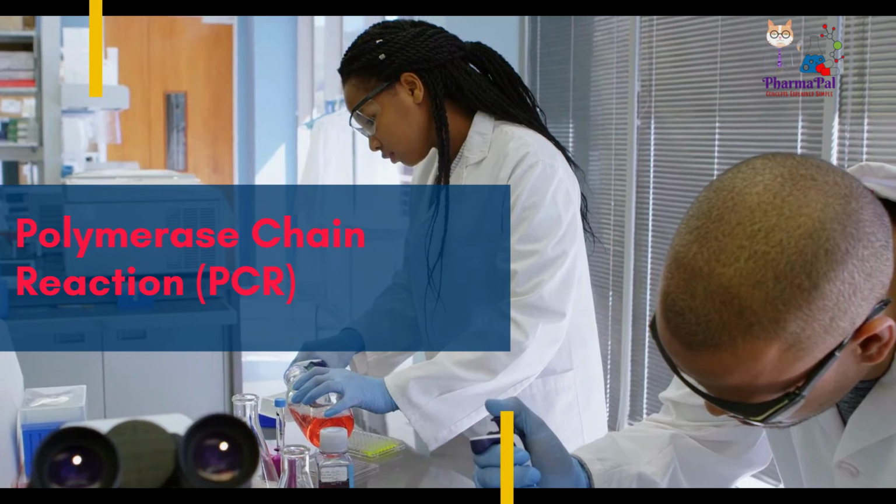The operational sequence of PCR involves 3 main steps. First, the DNA is denatured by heating it to around 95 degrees Celsius. Then, the primers anneal to the DNA by cooling it to about 50 to 60 degrees Celsius. Finally, the DNA polymerase extends the primers by adding complementary dNTPs at approximately 72 degrees Celsius.